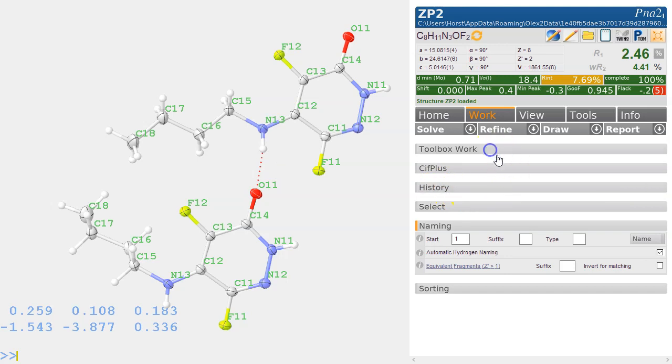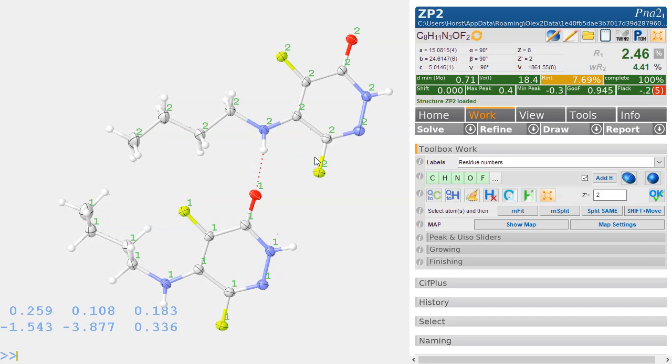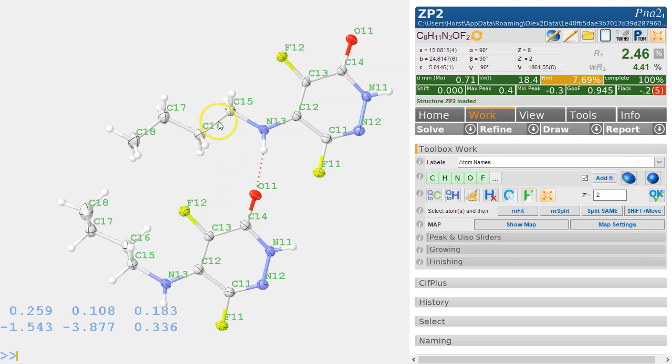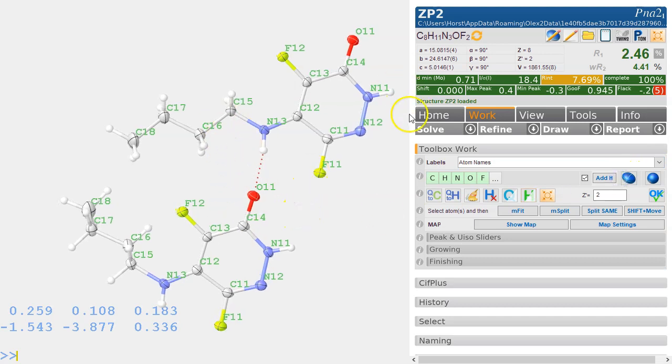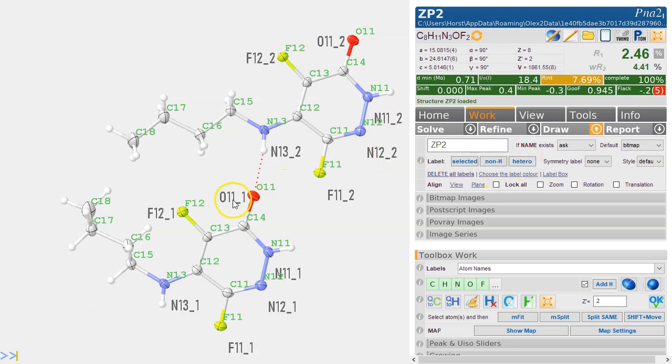If you go over to Toolbox Work and look at the labels, there is the option of having the residue numbers. You will see this is now residue one and this is residue two. Otherwise the labels are exactly the same. If you just go for the names, the atom names, then you will find them identical. Internally of course they're called slightly differently. They've got the underscore for the resi one and the underscore two for the resi two.